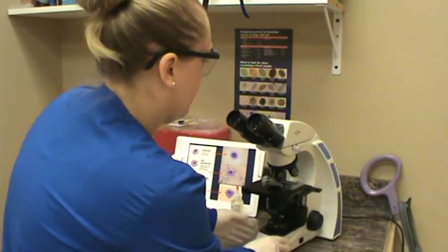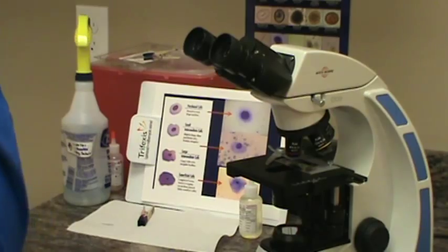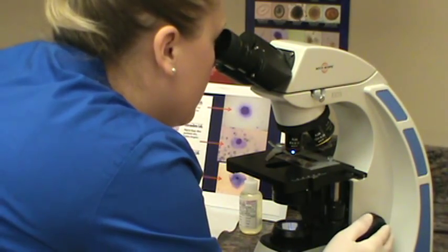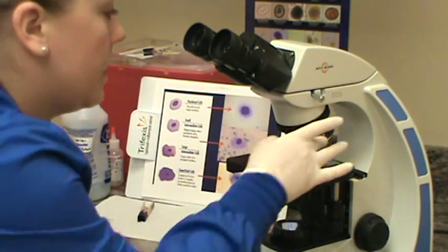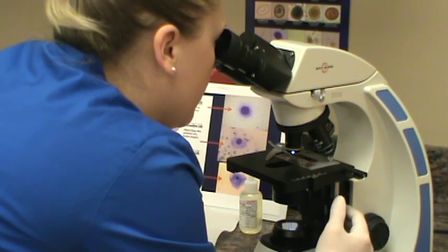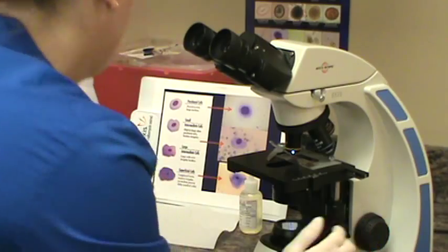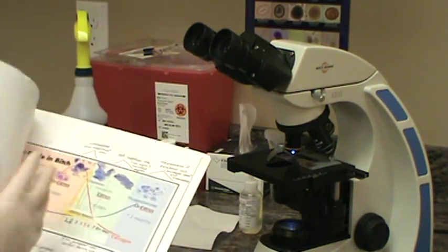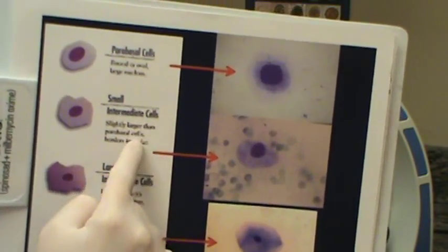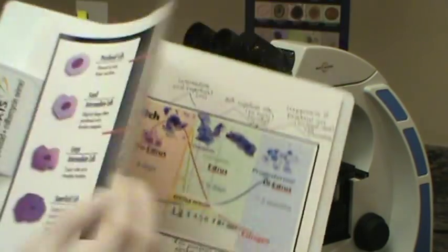I'm going to put it on the microscope starting at the 4X. On the 4X you're just getting it focused in and then you're going to move to the 10X. I'm starting to see a little bit of bacteria, a few red blood cells, and mostly parabasal cells. So I'm going to show you an example of a parabasal cell — this top one here. It's a mixture of small intermediate and parabasal cells that I'm seeing right now.